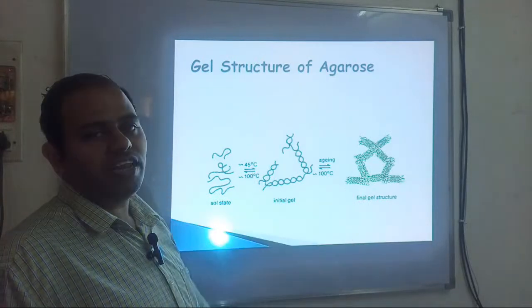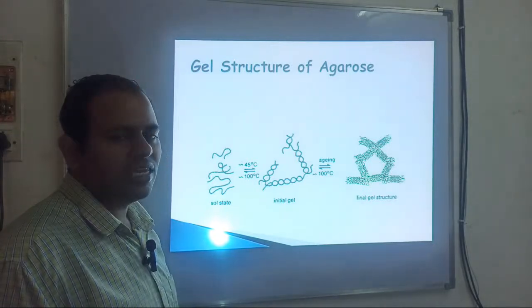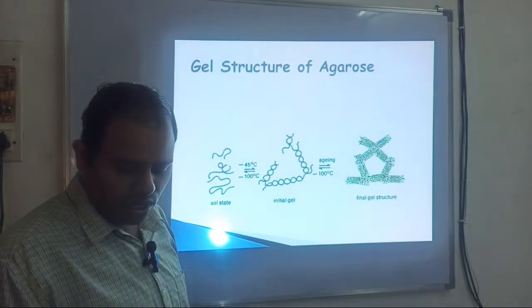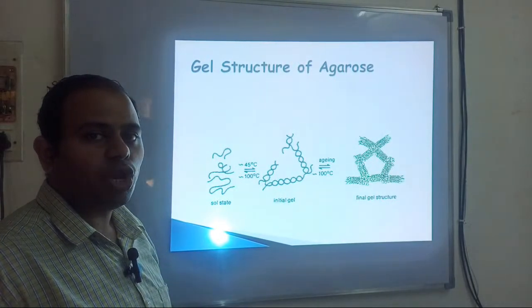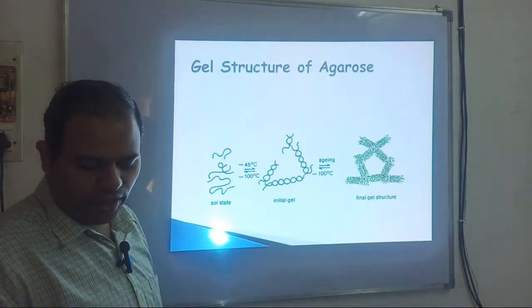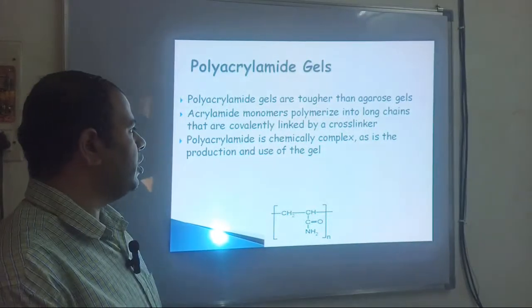The pore size will be very small if the concentration of agarose is taken in a large amount. Generally, a 1% concentration of agarose is taken. So for 50 ml, you have to take 0.5 gram agarose. For 100 ml, you have to take 1 gram agarose. But in some cases, for example, if you want to separate a plasmid molecule, which is very small in size, you have to take a low pore size agarose. So the concentration of agarose taken here is more, especially for plasmid isolation. It can be 0.8% or 1.5%, depending on different separations.